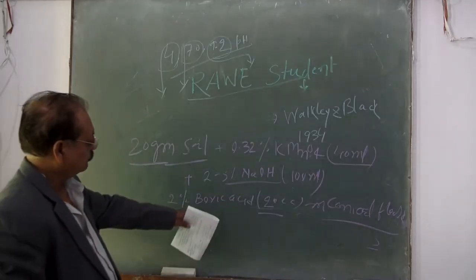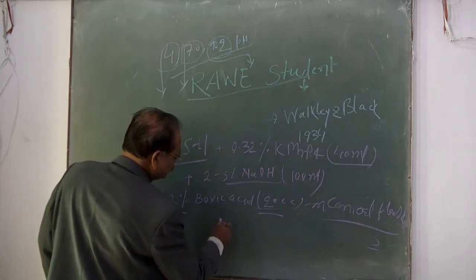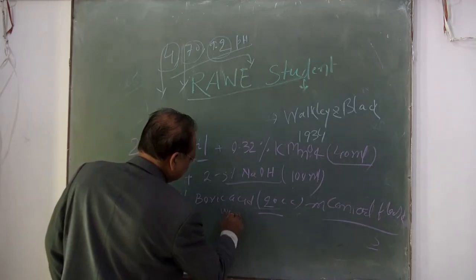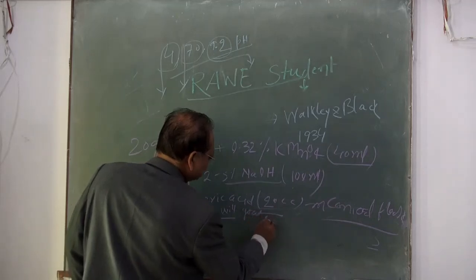This conical flask will be adjusted at the gas liberation point.